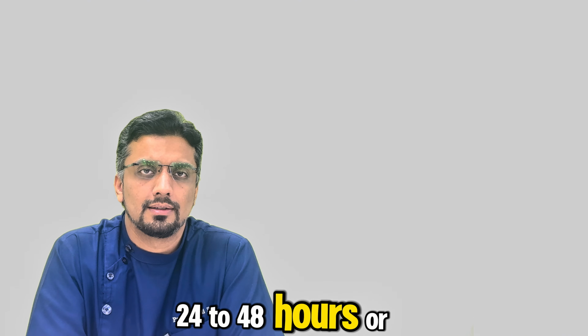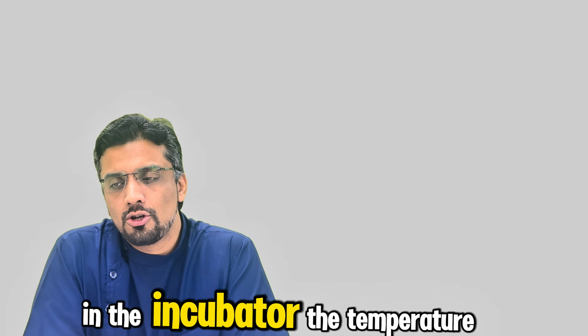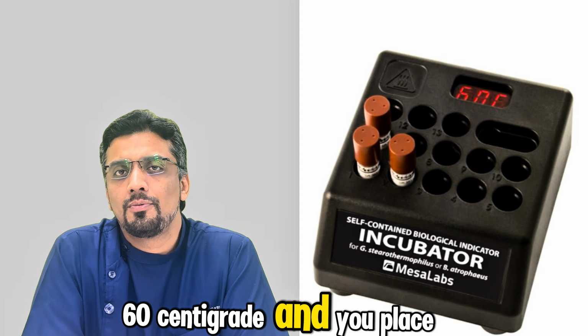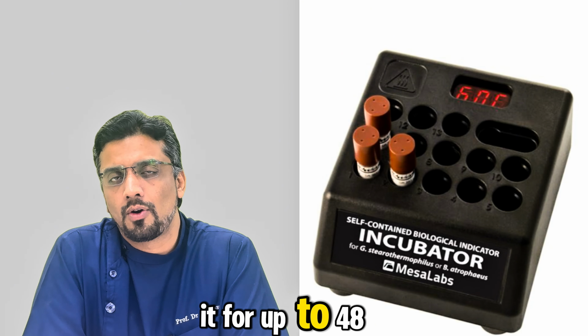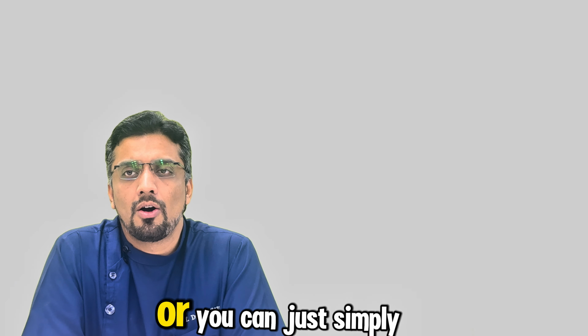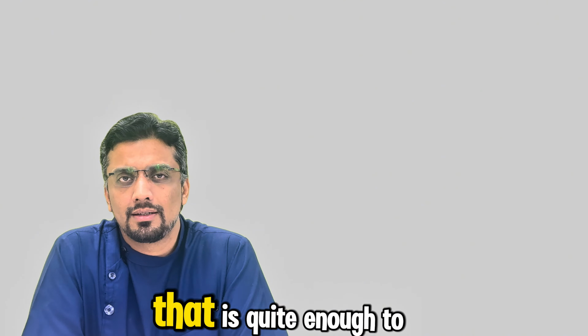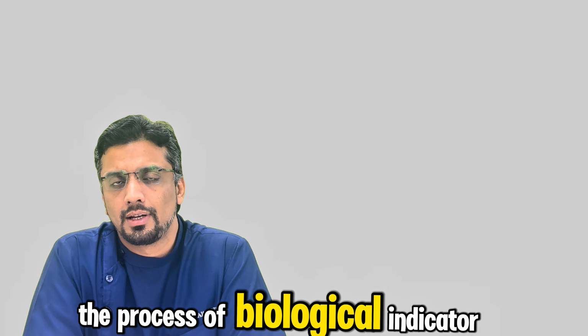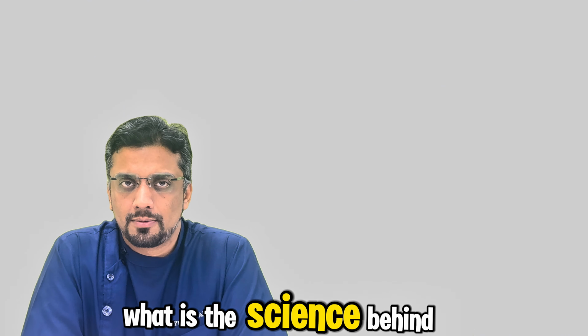What you do, you break the vial. I will discuss the structure of the vial in a minute. You break the vial, which is called the activation of the vial, and you place it in the incubator. In the incubator, the temperature is 55 to 60 centigrade, and you keep it for up to 48 hours. You may send it to the lab to culture, or you can just simply see the color. That is quite enough to tell you about the process of the biological indicator. What is the science behind it? Please do consider the structure of the vial.